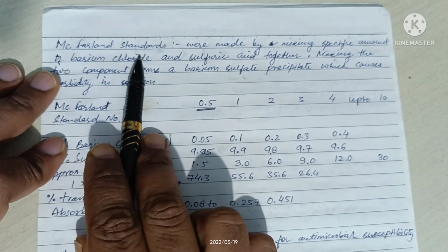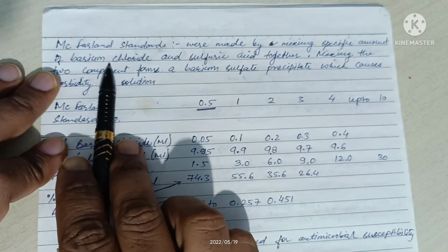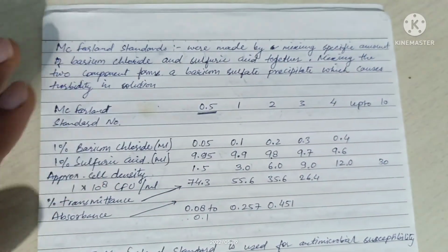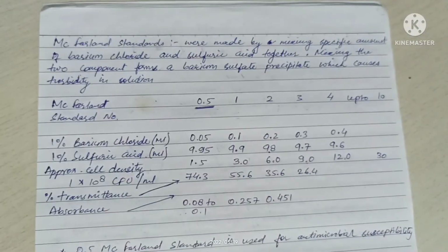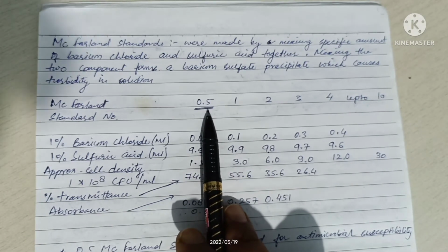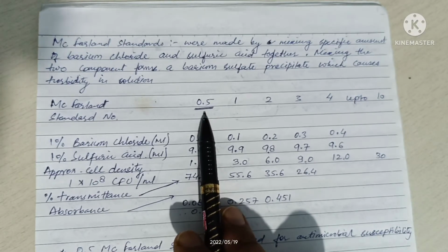I am not going to brief it at this time; I will cover it in another lecture. We have to standardize the turbidity in the broth using the McFarland standard, adjusting to the 0.5 level by adding BHI broth into the tube, to adjust the turbidity of the bacteria to a 0.5 McFarland standard.